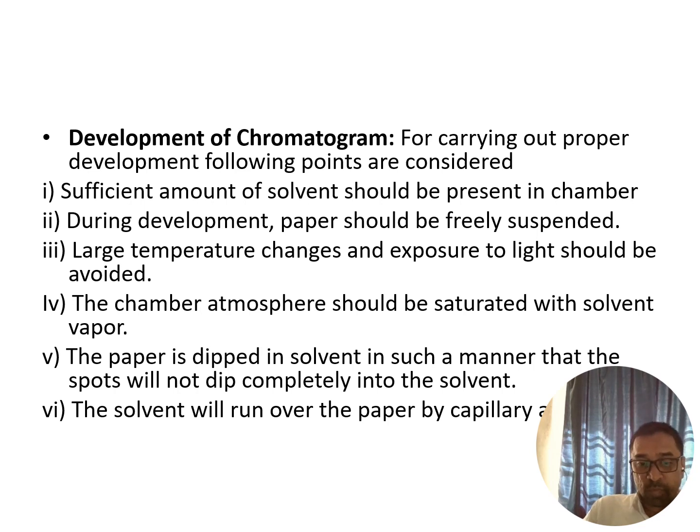For development of the chromatogram, we need to fill the solvent in the chamber. Then we need to carry out chamber saturation by applying filter paper soaked in the same solvent which we are using for the separation of components or mixture.